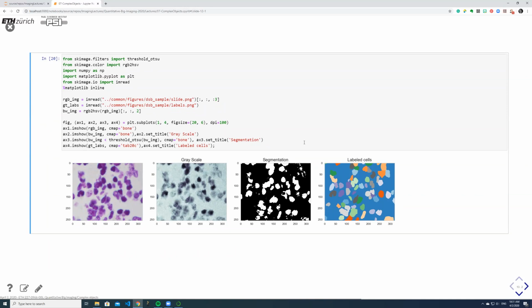And this is what's actually already preloaded, so it was someone else who did it. But we are going now into trying to segment these images. But you can also see that there is a difference between the auto segmentation and this clean image. So they have done something more to the data than we did, just doing the plain auto segmentation.